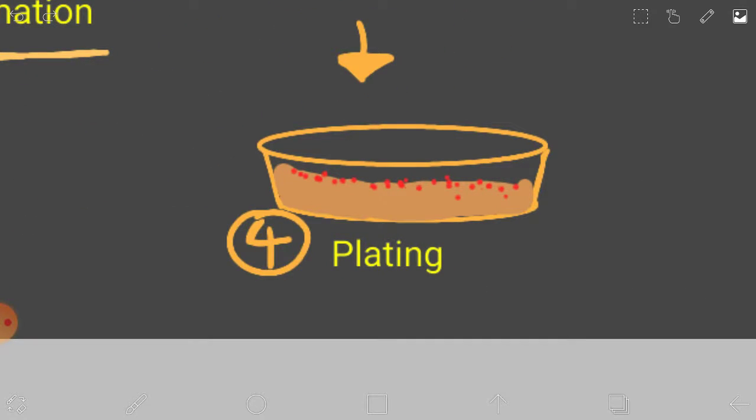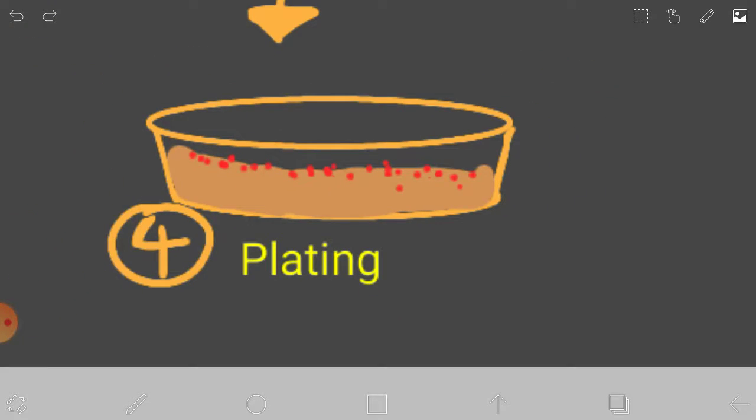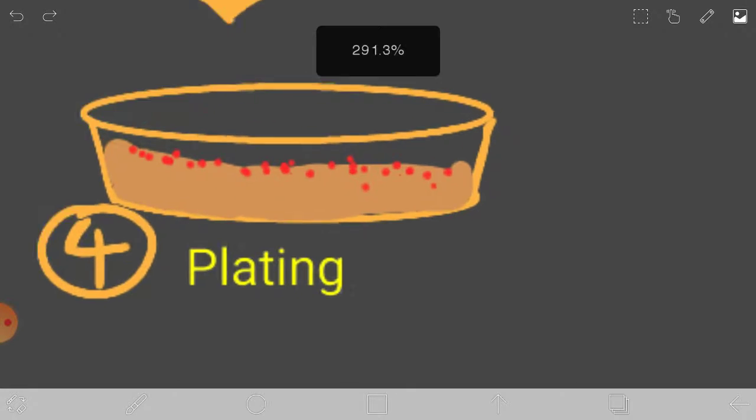And now moving on to plating. Plating is when whatever bacteria you used is placed inside an agar plate. Agar plate, yes.